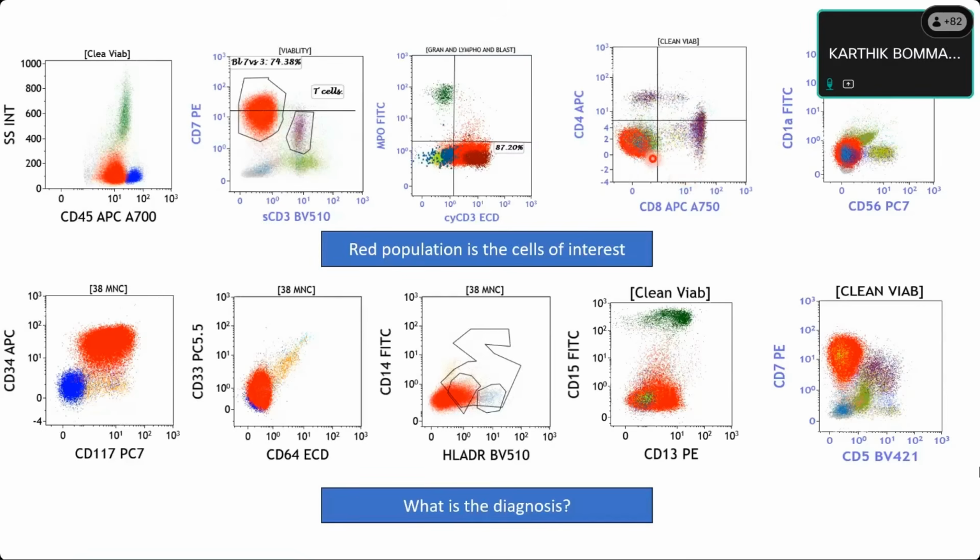Even without looking at the sample, whether it is bone marrow or peripheral blood, I can tell, because what will the CD4 to CD8 ratio be in peripheral blood? Which will be more? CD4 cells. But in bone marrow, the scenario is reverse. In peripheral blood, if you get more CD8 positive cells than CD4 positive cells, you should look for HIV and other infection workups. But in bone marrow, CD8 positive cells are more, and that is normal. So these cells are CD4 negative and CD8 negative.